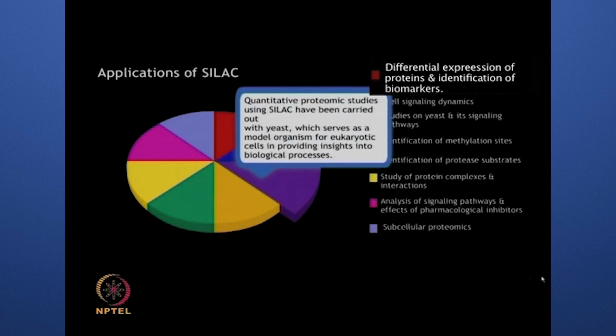Quantitative proteomic studies using SILAC have been carried out with yeast, which is a model system for eukaryotic cells, to provide insight into various biological processes.